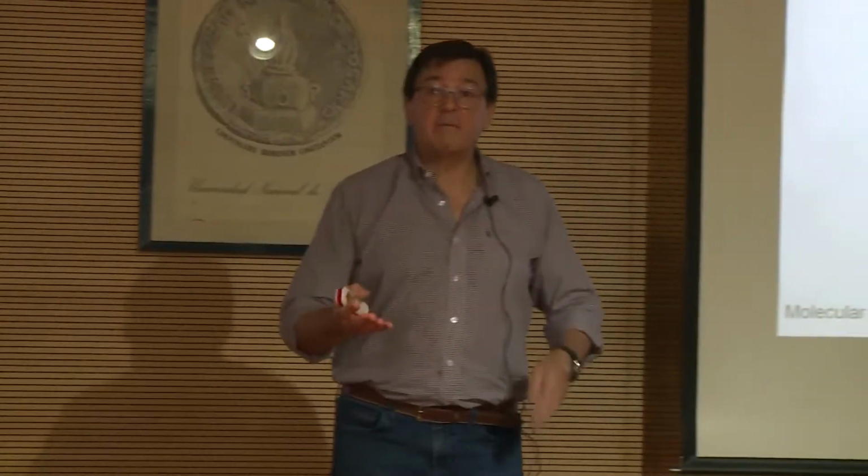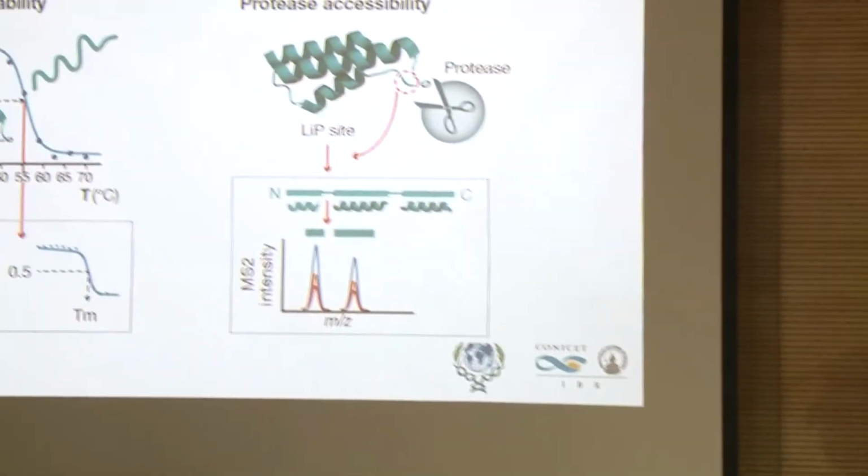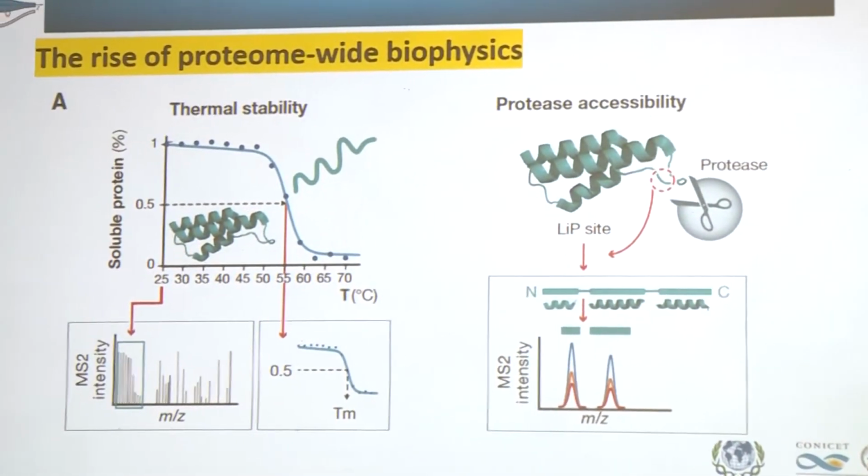What is interesting is that you have different physiological situations with the same cell. You get that these proteomes change, and this information is relevant and may be analyzed in a way that you can even compare.